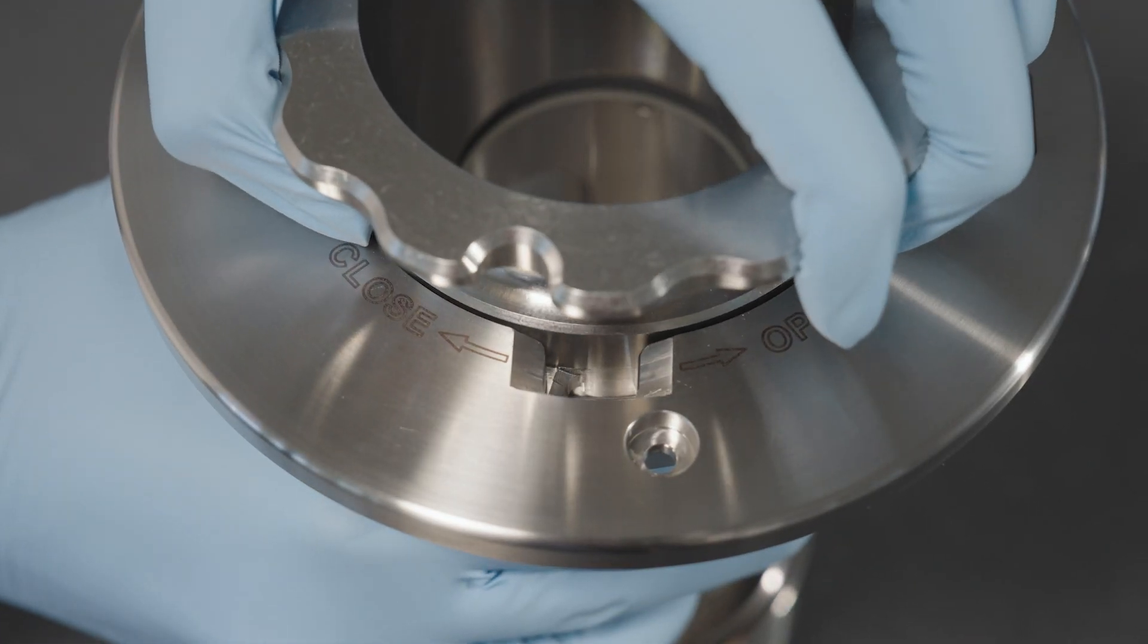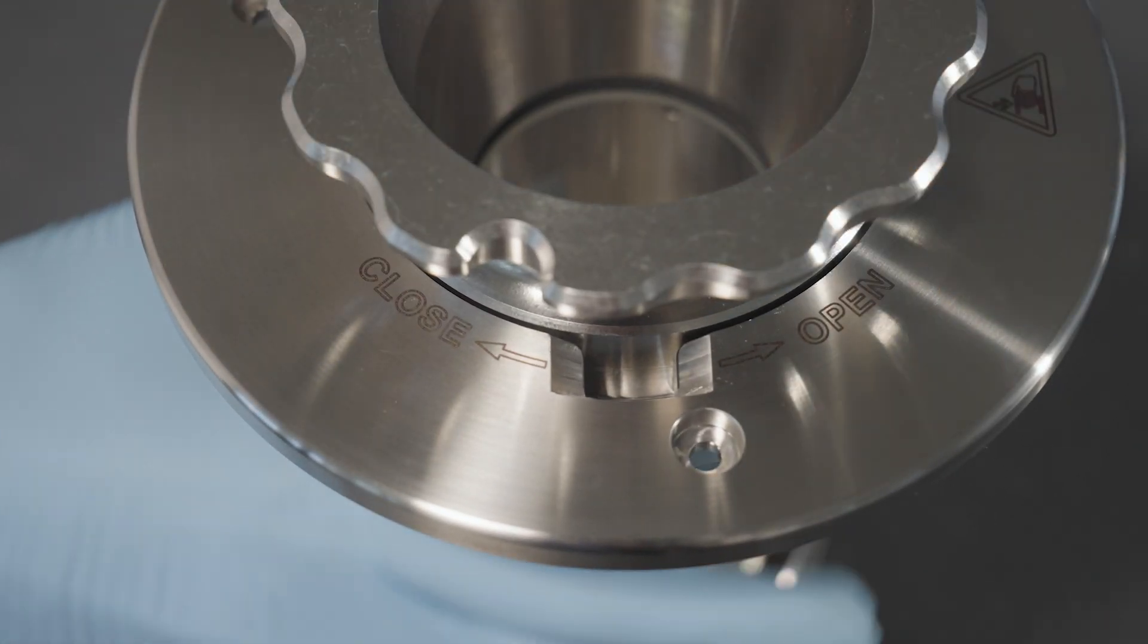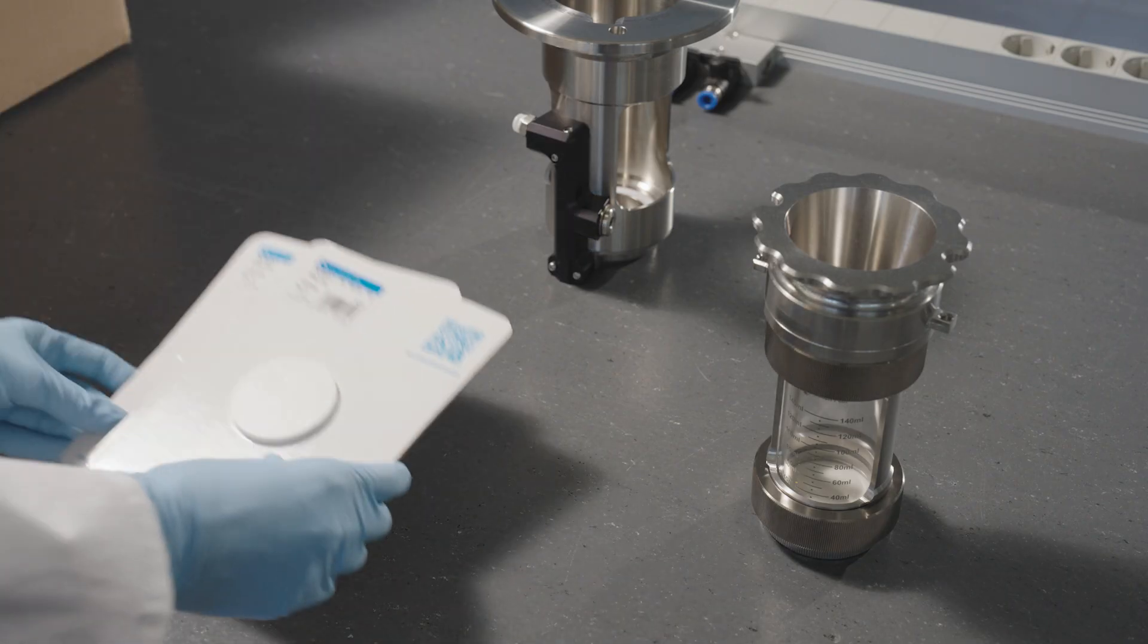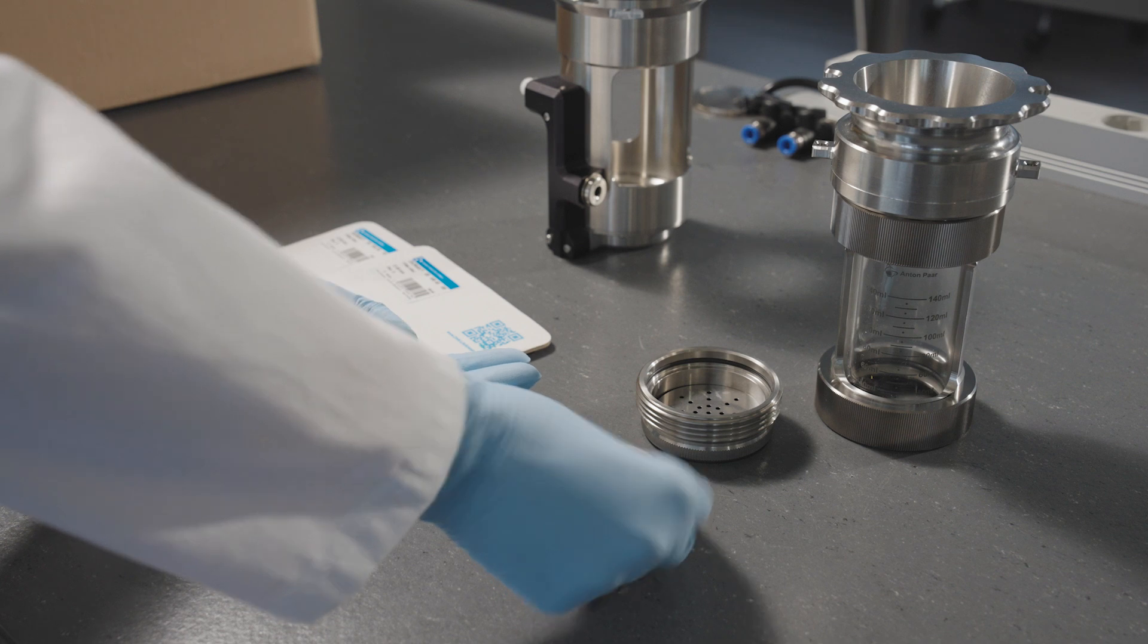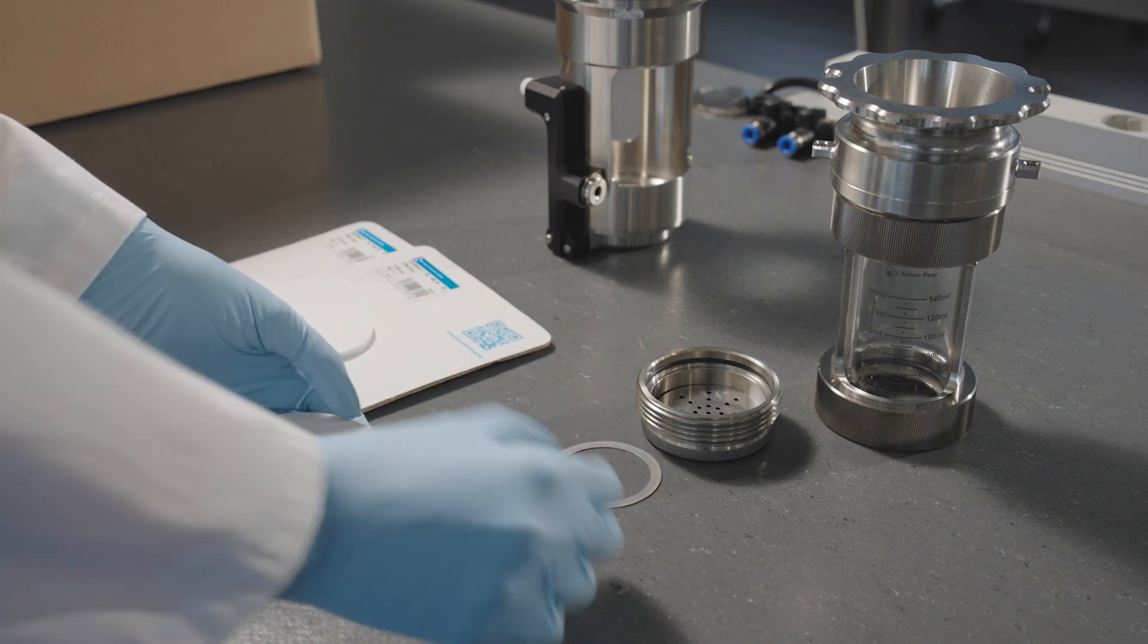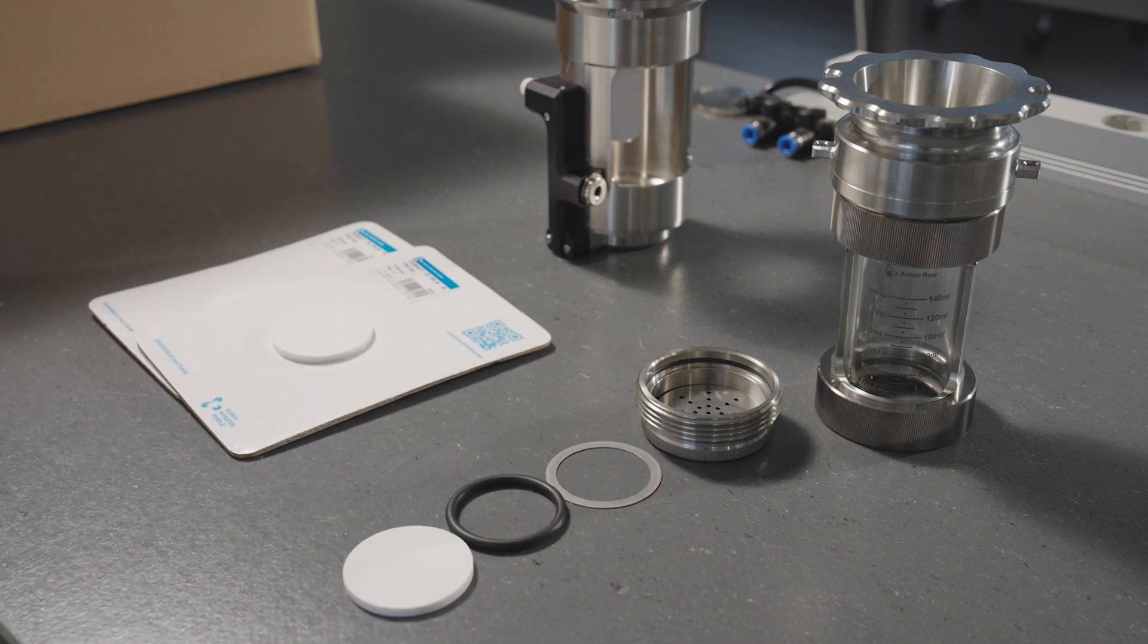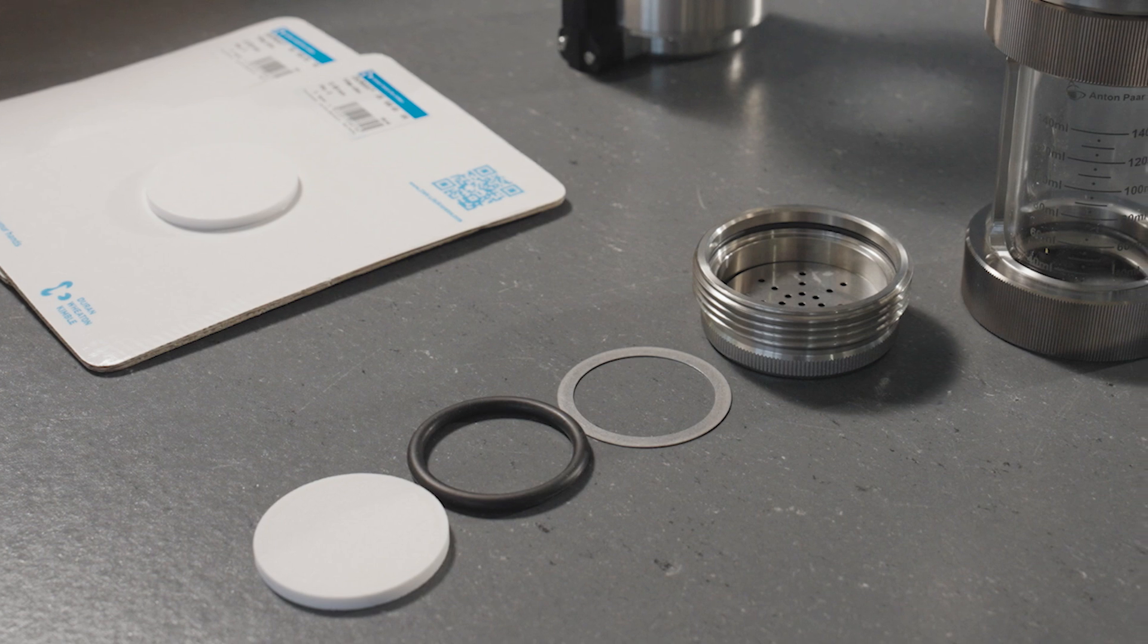Incorrect assembly will prevent the locking mechanism from engaging. If the measuring cell base is damaged or leaking, the permeable base plate must be replaced. Unscrew the lower part of the measuring cell and replace the gasket. Clean the screw connection regularly.